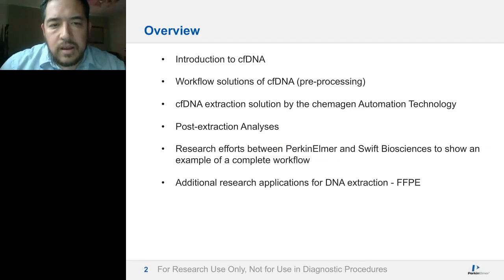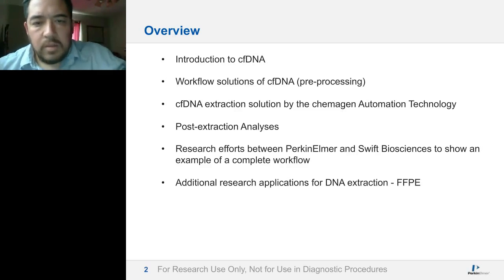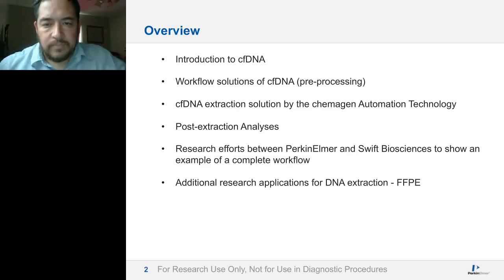In this talk, I want to go over the main points of what I want to discuss. So what I'd like to do is just give a brief introduction to cfDNA, followed by workflow solutions for cfDNA, specifically focusing on pre-processing. And then the heart of this is the circulating cell-free DNA extraction solution presented by the chemagic automation technology.